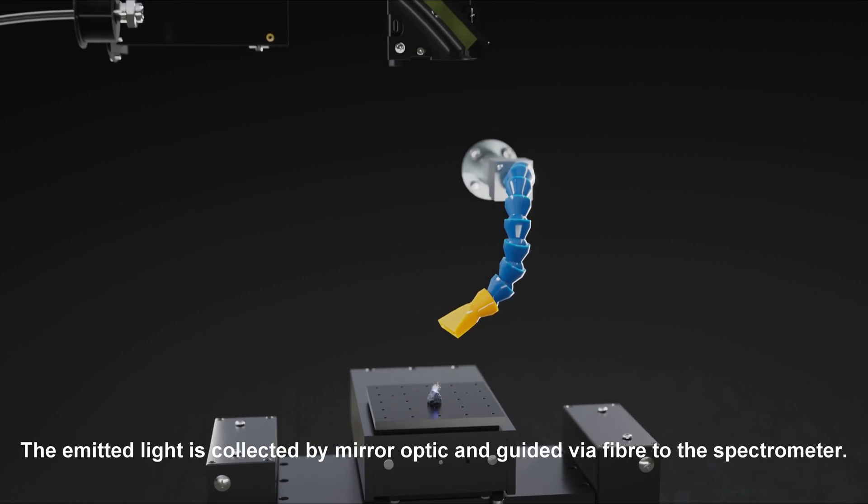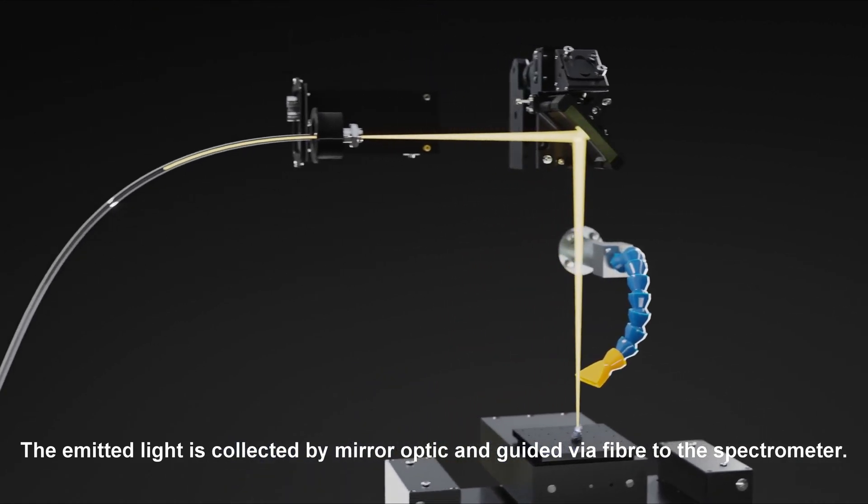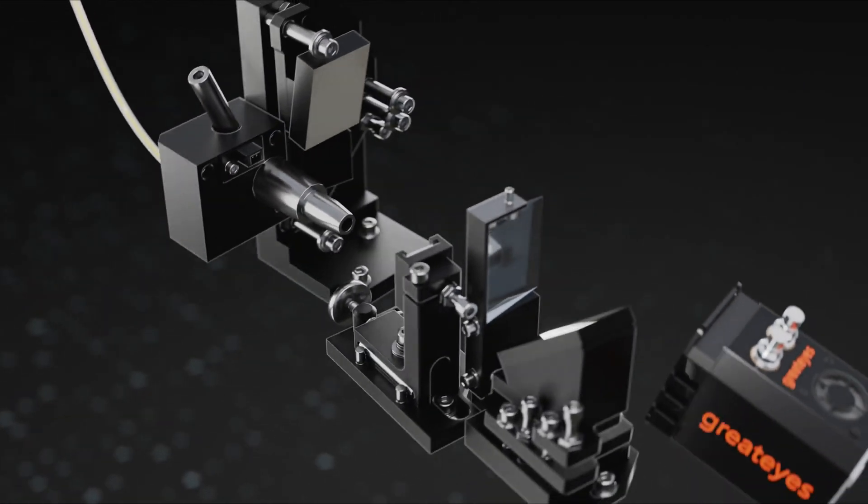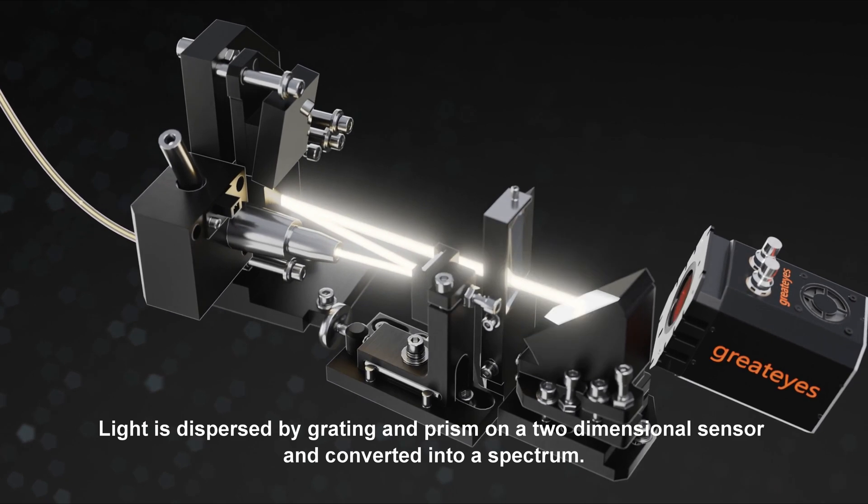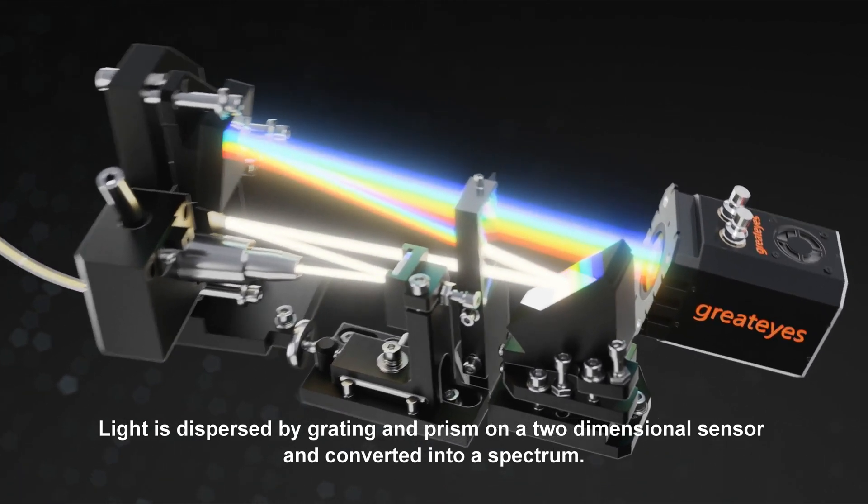The emitted light is collected by mirror optics and guided via fiber to the spectrometer. Light is dispersed by grating and prism on a two-dimensional sensor and converted into a spectrum.